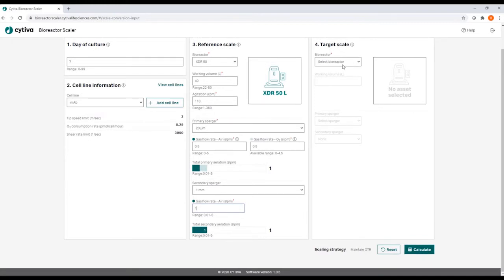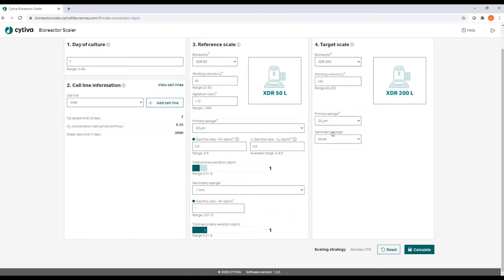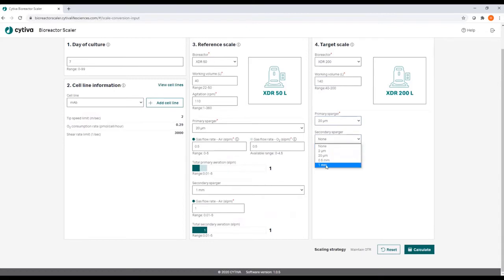Then you move on to selecting the target scale bioreactor from the pull down menu, define the working volume, and again the sparger configurations with the micro and the macro sparger.